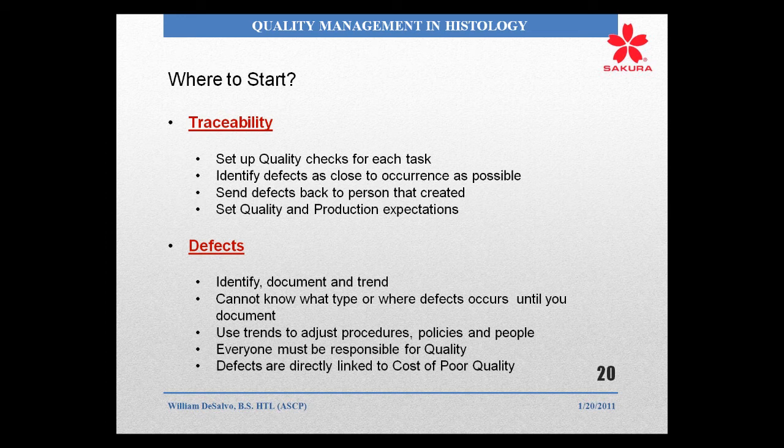This is part of your document control, and how you do this is that you have to set up quality checks for each task. Again, you can't accept that we ran a quality control slide at the beginning of the day and then ran out our slides the rest of the day, or you wait for pathologists. You need to look at where the critical-to-failure steps are in your process and set up regular quality checks. The idea of a quality control check is to identify and recognize when you're not meeting your minimum performance standards before it affects your end result.